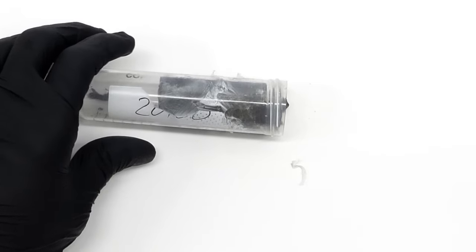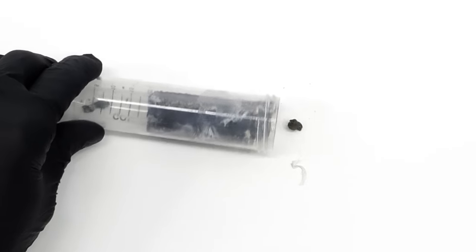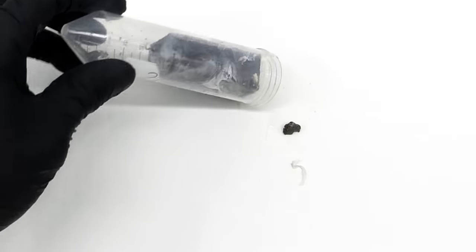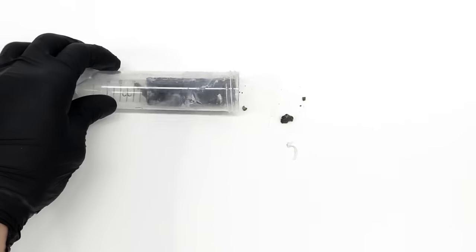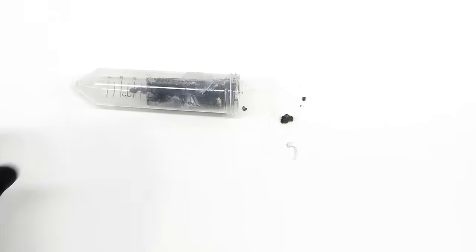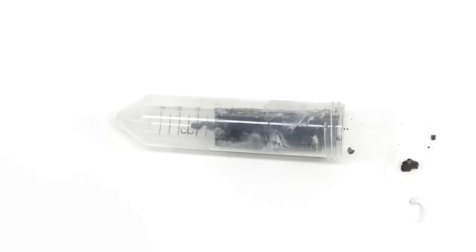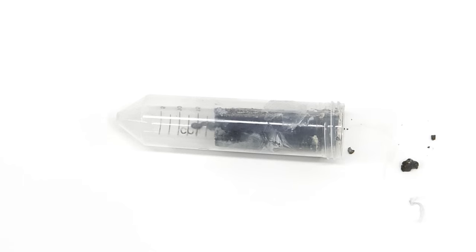Now, it should hopefully just slide out. Okay, so it's apparently stuck, and it's going to be a bit more annoying than I thought.